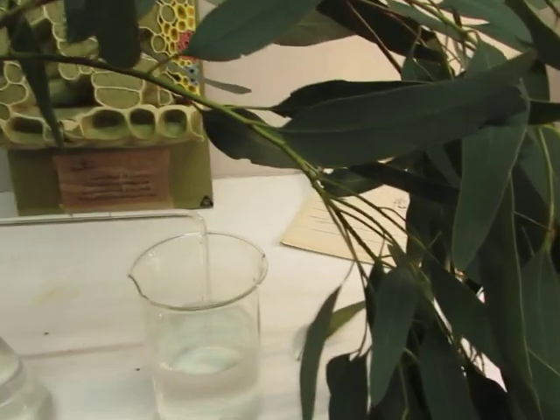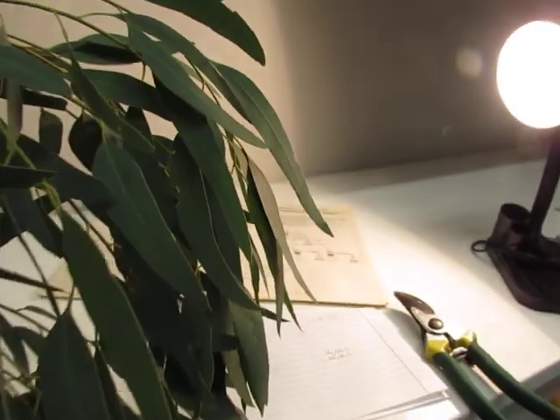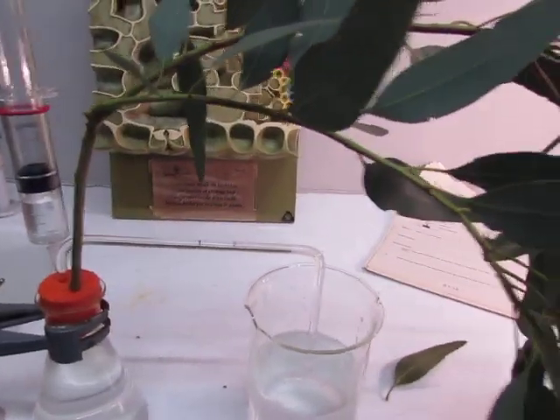I'll take the third one and then I calculate the mean of the three measurements, and in that way I get a more accurate indication of the rate of transpiration.